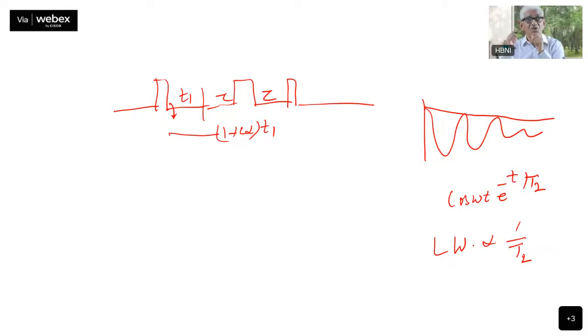Now, during this pulse sequence, normally when there is nothing else, it is actually T2 star because we have the inhomogeneities, etc., all put together. That is the normal line width which will come.